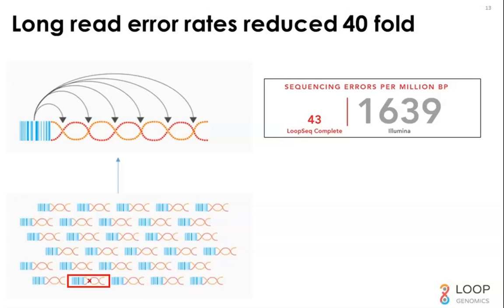So errors in sequencing typically arise from the inherent error rate of polymerases, and those are inserted during PCR. So if there happens to be a randomly introduced error in one of the short reads, as typically happens, we, in almost all cases, have other short reads that cover the exact same position in the long read that do not have that randomly introduced error.